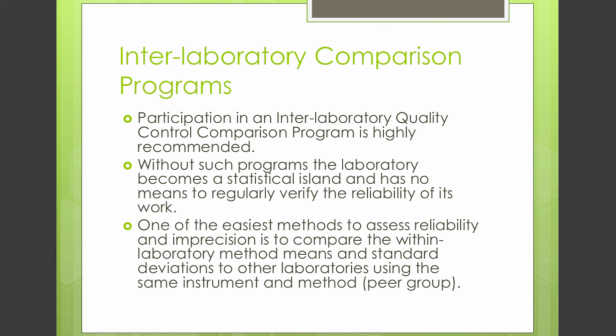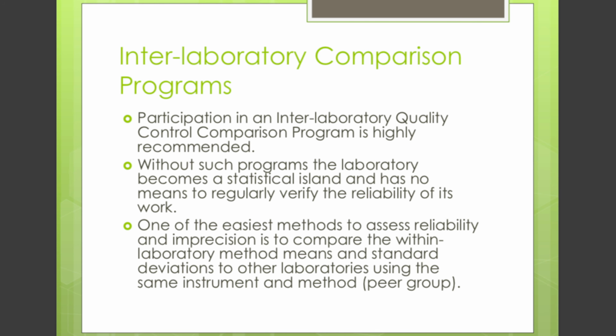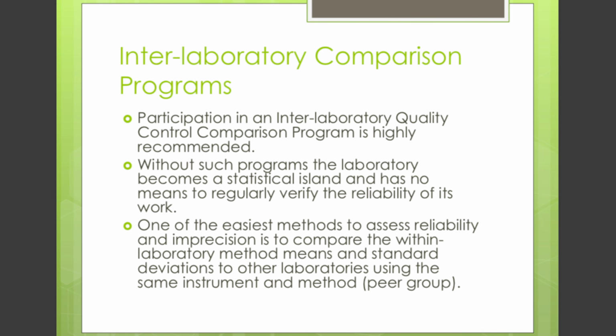Another application of statistics is the interlaboratory comparison program. Participation in an interlaboratory quality control comparison program is highly recommended. Without such programs, the laboratory becomes a statistical island and has no means to regularly verify the reliability of its work. One of the easiest methods to assess reliability and imprecision is to compare within-laboratory method means and standard deviation to other laboratories using the same instrument or method, what is termed the peer group.